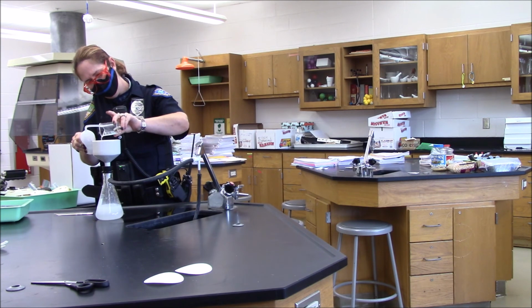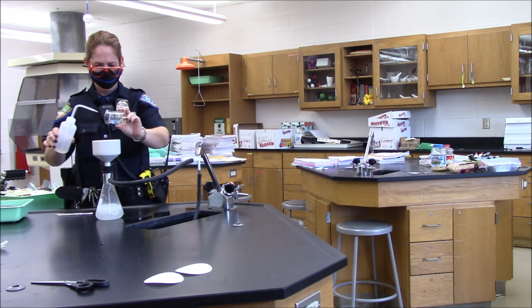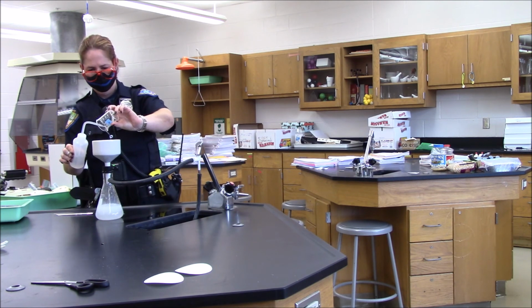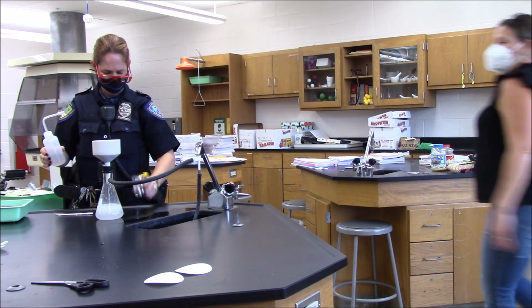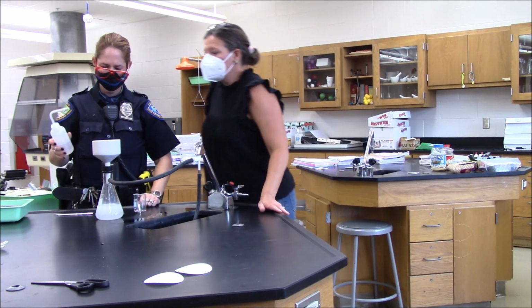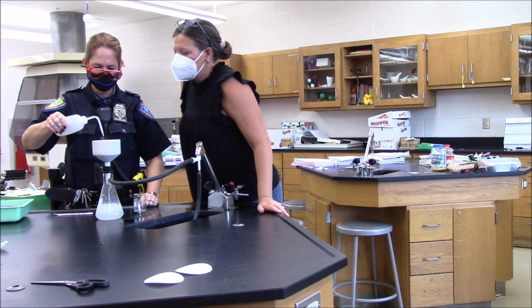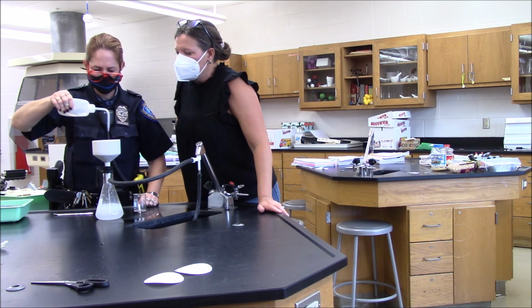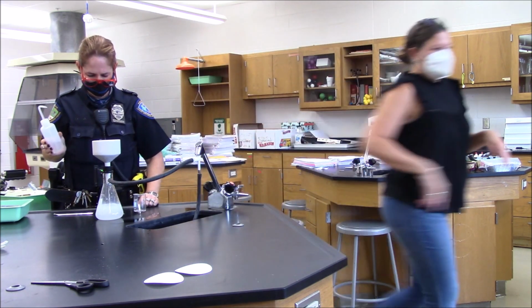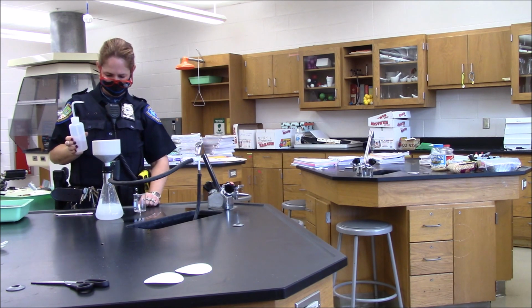All right, that looks pretty good to me. Now, once all the liquid passes through, we're going to add a little bit more water to make sure the filtrate is clean. So, you can add some water. Just rinse it off. There we go. Like that. And then once the water passes through, we're done.